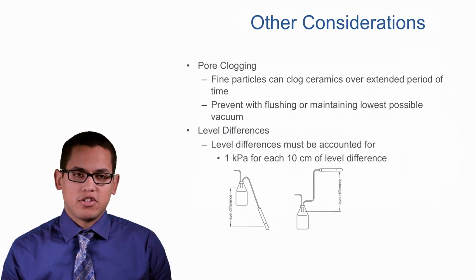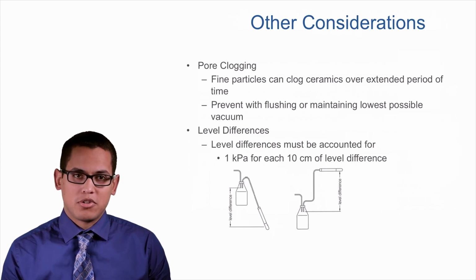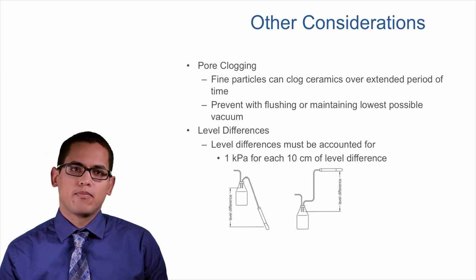And another consideration, if you're trying to sample from very deep, water will begin to cavitate at around 85 kilopascals. So if you're trying to sample deeper than 8 meters, you could begin to run into issues pulling a sample to the surface.